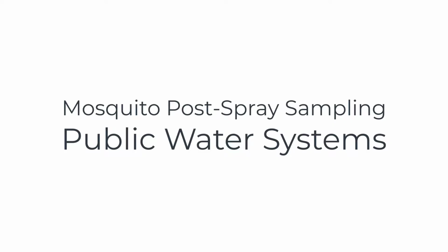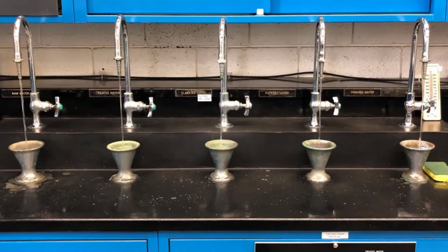Mosquito post-spray sampling. Public water systems. Samples will be collected from public water systems that use a surface water reservoir for source water. Samples will be collected from raw and finished water taps at the drinking water treatment plant. These samples will be representative of the reservoir source before and after treatment.